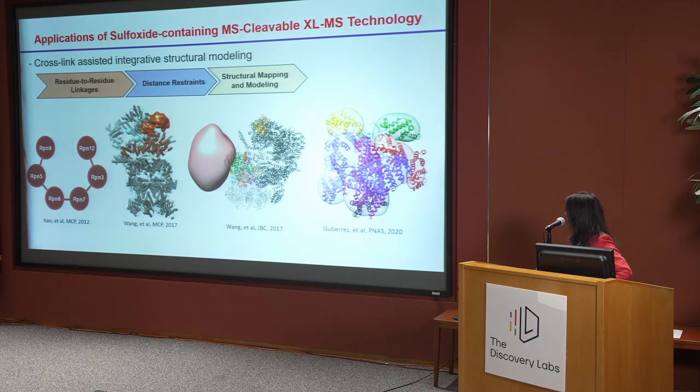And we can also model ECM29, which is a regulator of the 26S proteasome under oxidation stress, and show its localization and also understand its regulation of the stress-triggered disassembly of the 26S proteasome. Then using this information, we can generate the model of the COP9 signalosome. All this information allows us to generate not only the interactions, but also the structural aspects.